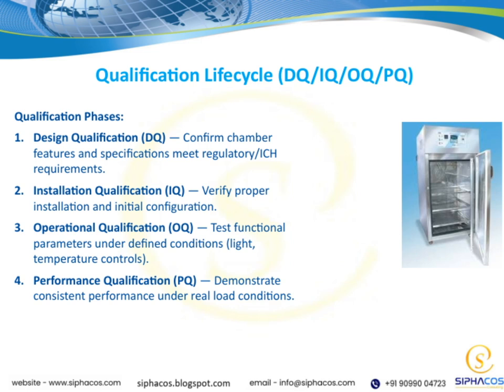Finally, performance qualification, or PQ, demonstrates that the chamber can consistently perform under real-world load conditions, confirming it will reliably meet its intended purpose. Overall, this life cycle helps us systematically validate each stage, ensuring our equipment is compliant, properly installed, functioning correctly, and performing reliably throughout its operational life.